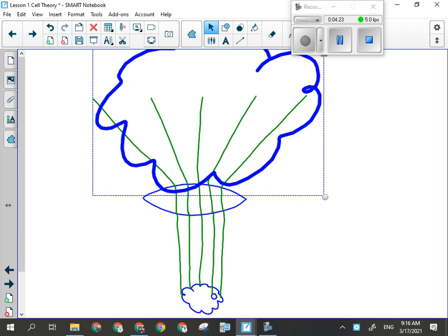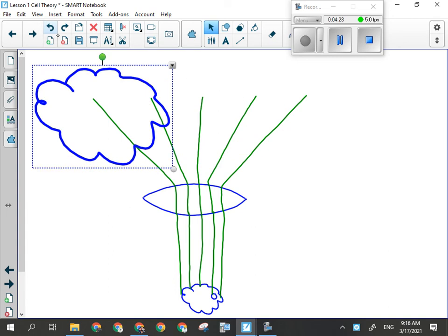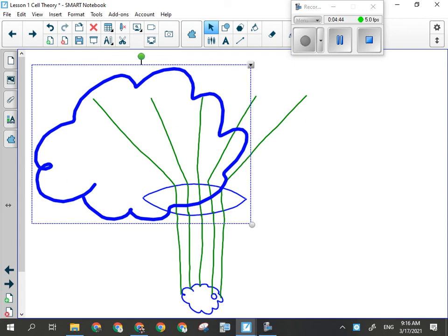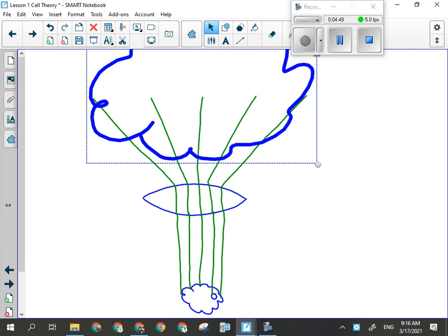I didn't flip it the right way. Sorry, guys, I forgot I could do this. It's been a while. So it has to go this way. Flip. That's okay. The light that came from this little bit down here is now over here. Everybody with me on that? I didn't put the circle in here, but the little circle would be right there.